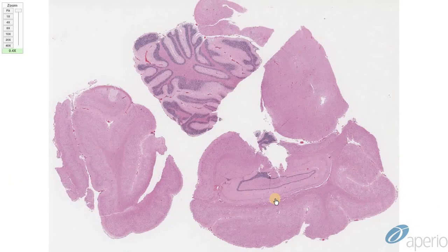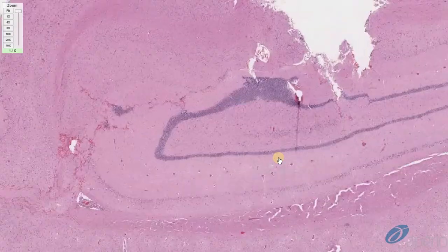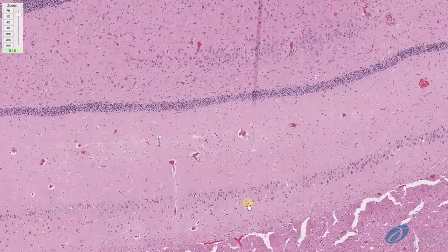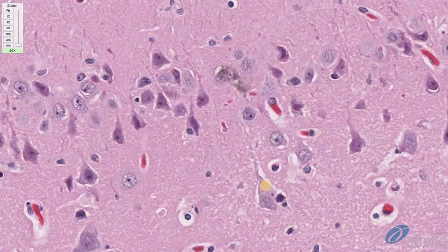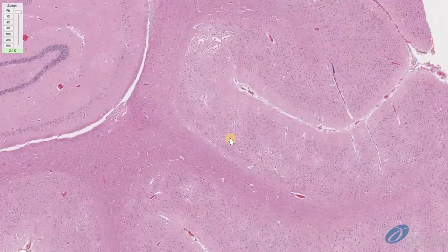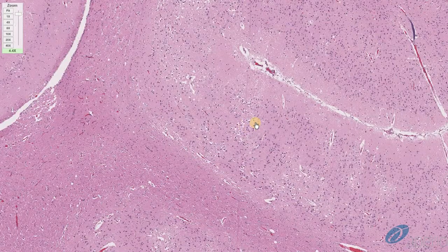This is another case from a mink, and the features are essentially the same. If we look at the hippocampus and the hippocampal neurons, we can see intracytoplasmic nigri body inclusions. But this case additionally has spongiosis.